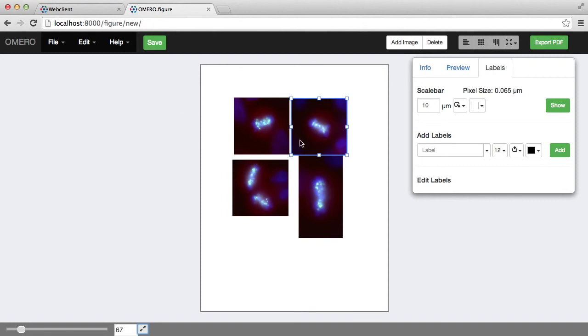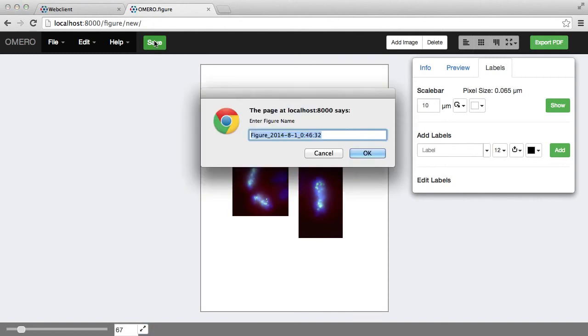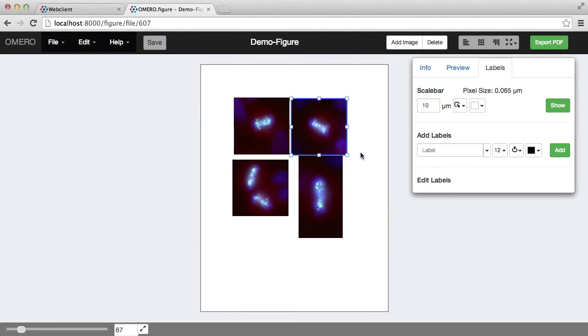Once I've done some editing, I can save the figure, give it a name, and that saves the figure to the OMERO server.